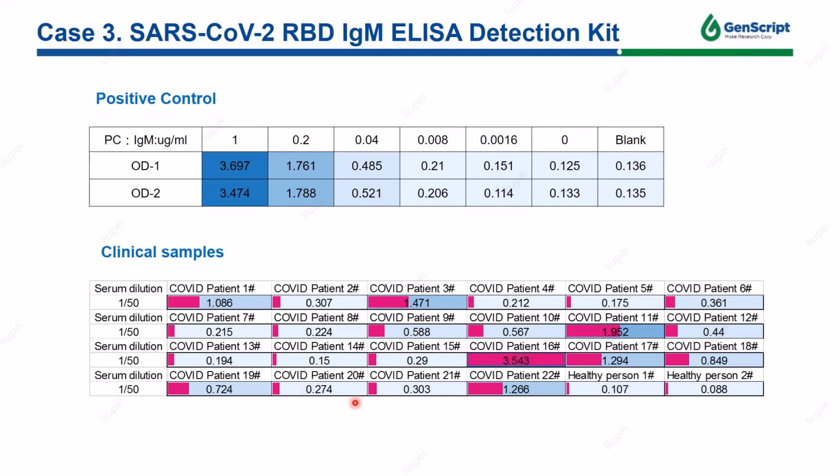According to the immune response to infection, as we know, at the earlier time of infection, IgM antibodies are generally detectable in the blood several days after the initial infection. Although levels over the course of infection are not well characterized, IgM detection is very useful for earlier detection. The principle is the same as the IgG kit, so I just show the detection results.